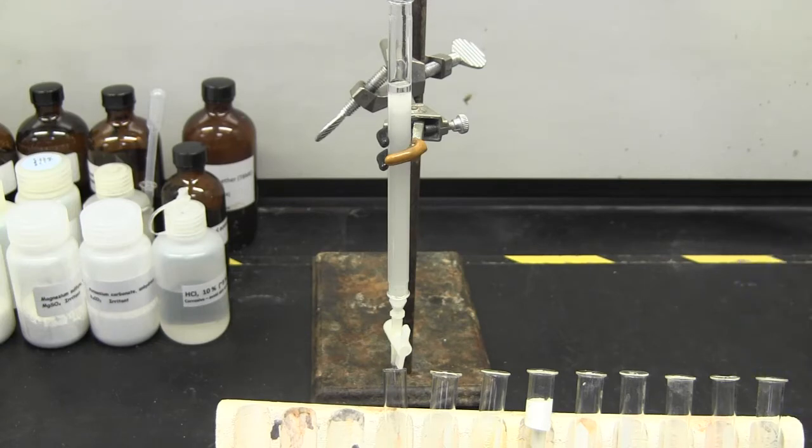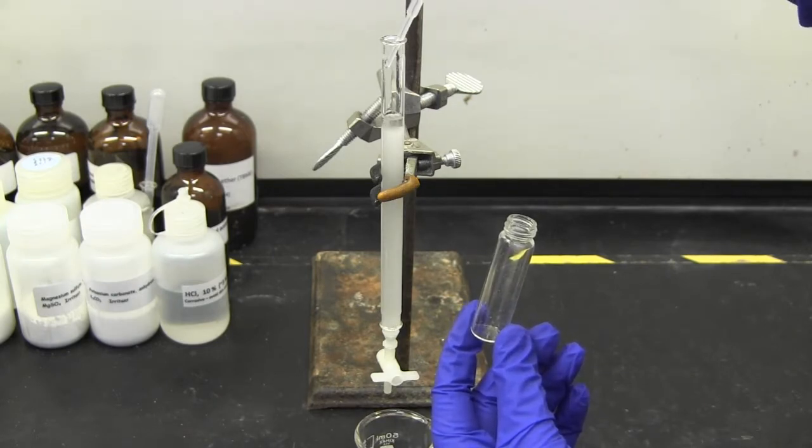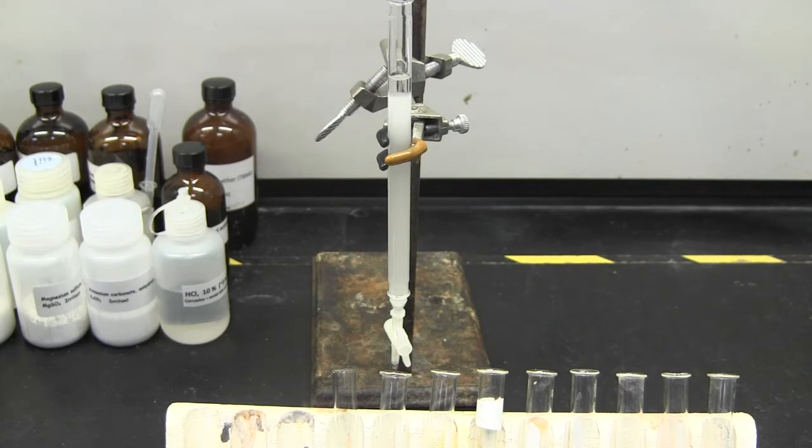Do not expose the gel to air. Now add your oil to the column and let it run into the gel. Close the stopcock before the gel is exposed to air and add more solvent.